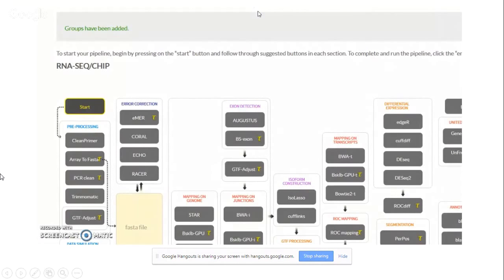So when you are ready to prepare the pipeline, you will notice that some buttons appear in a bright black lit up section and others are gray. Only the black ones you are able to press at each time. This was made for convenience because we think that sometimes choosing the algorithms is not so simple.